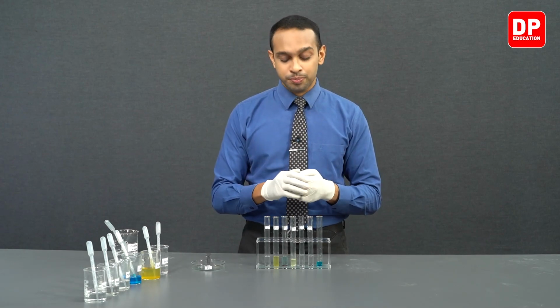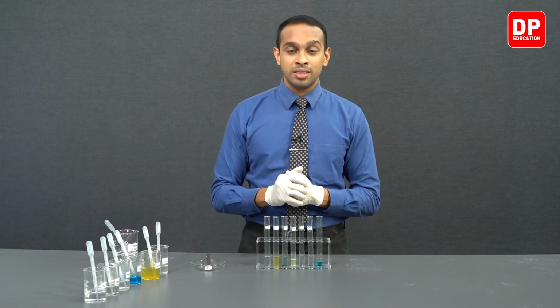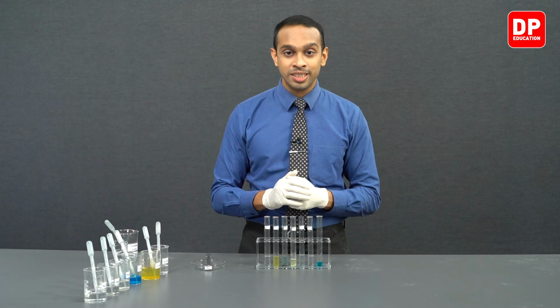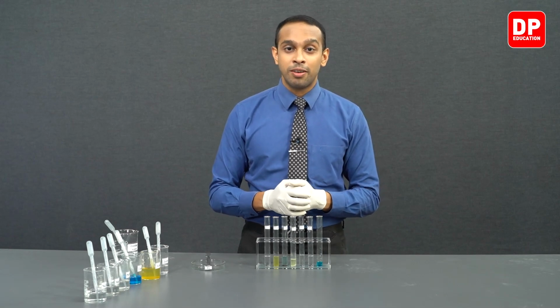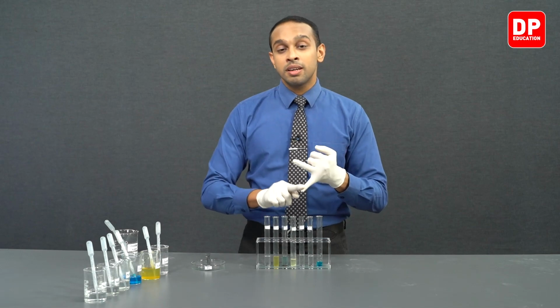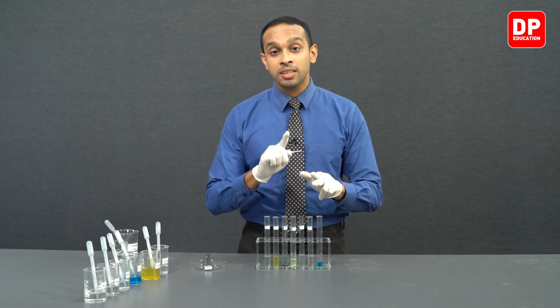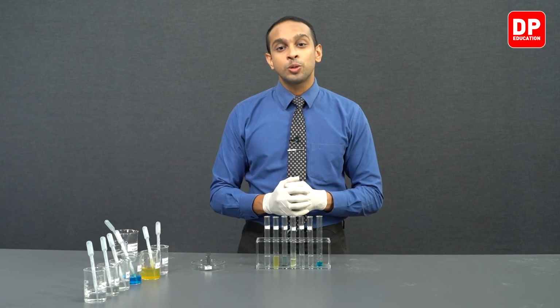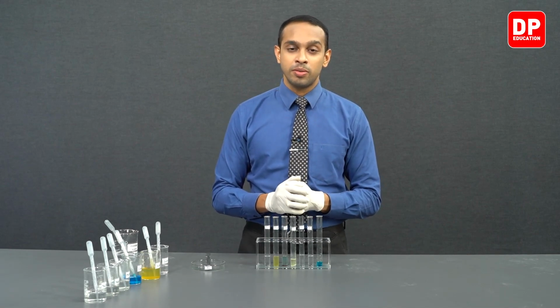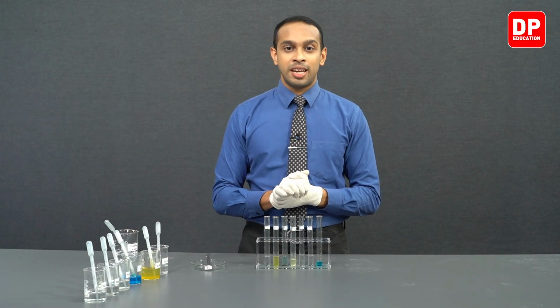So you can say out of the 5 other metals, after taking iron out of the picture, out of the 5 other metals that we have over here, iron is more reactive than copper and lead, but less reactive than sodium, magnesium, and zinc. So after noting these observations, we can now move on to the next reaction.